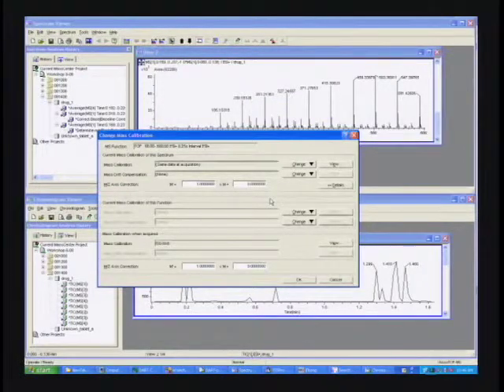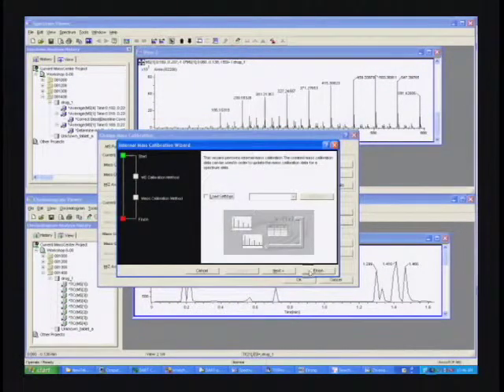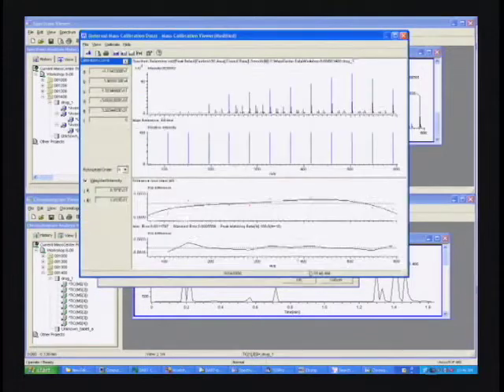And then we'll need to use that information to change the mass calibration, and this way we will have the mass axis move to where it needs to be, to our reference of polyethylene glycol. So we have a curve that looks like this. This is our spectrum at the top. This is our reference spectra here of each of the PEG peaks.